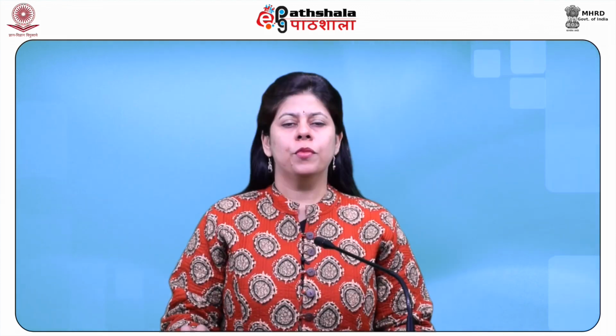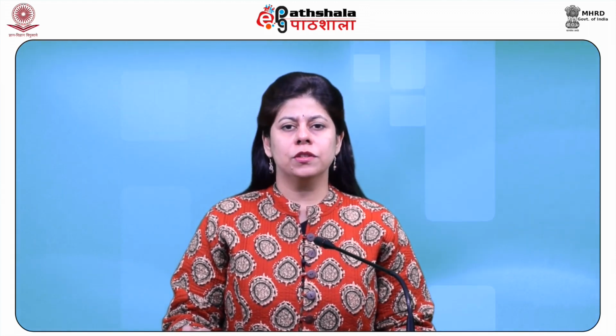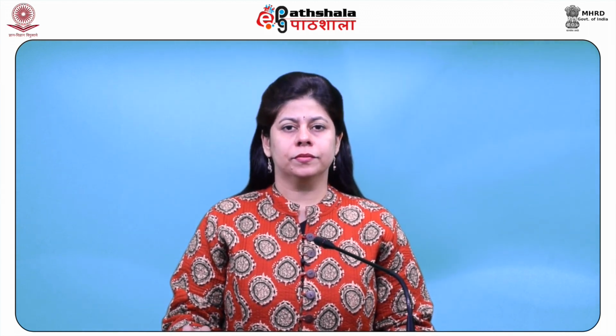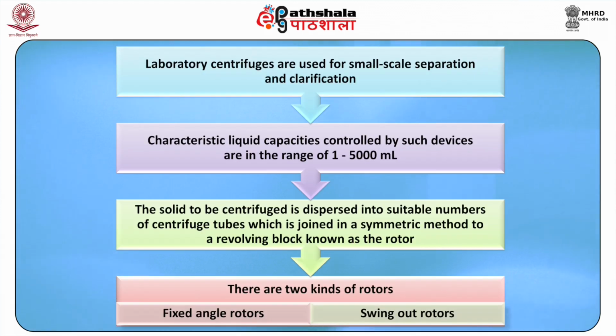Types of centrifuges. Broadly, centrifuges are classified into two categories: laboratory centrifugation and preparative centrifugation. Laboratory centrifugation. They are used for small-scale separation and clarification. Characteristic liquid capacities handled by such devices are in the range of 1 to 5000 ml. The solid to be centrifuged is dispersed into suitable numbers of centrifuge tubes that appear as test tubes, which are joined in a symmetric manner to a revolving block known as a rotor.